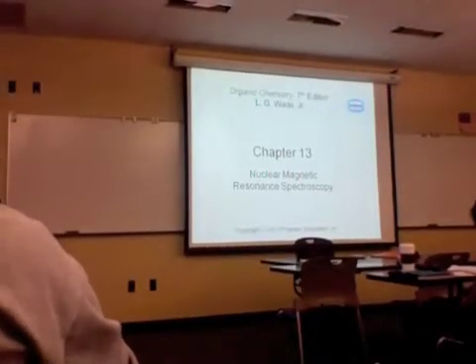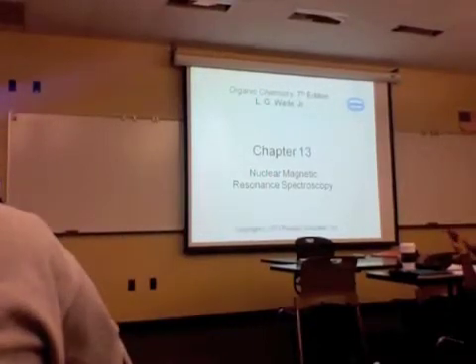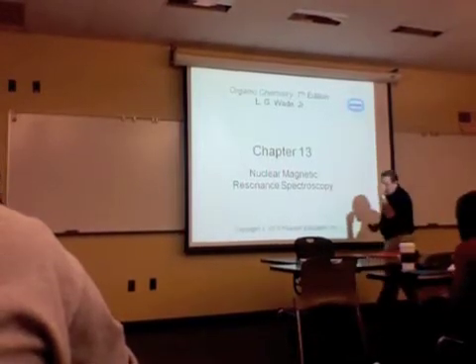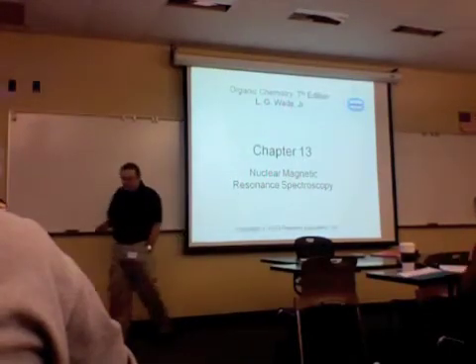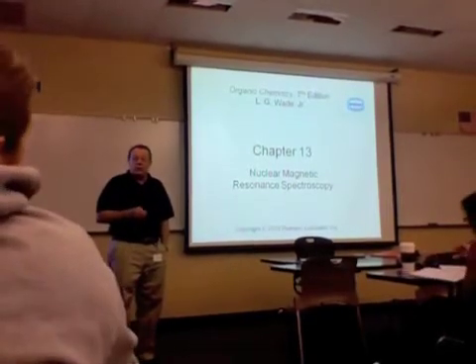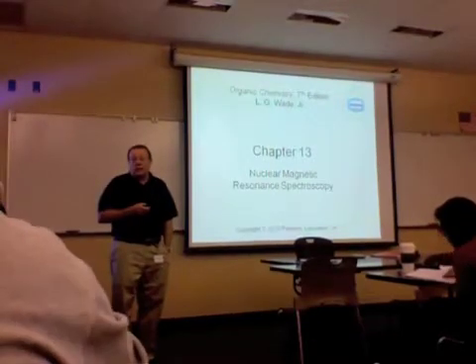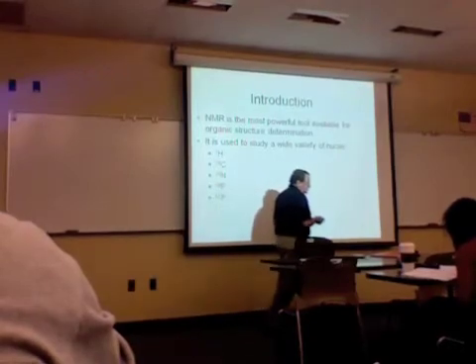This should be a review for you as well. Some of you more so than others, but NMR is an important component in instrumental analysis and organic chemistry. And in my opinion, it's more powerful than IR. IR puts you in a general category. NMR will allow you, with proper interpretation, to actually identify the compound. And so we're going to go through that again fairly quickly here.